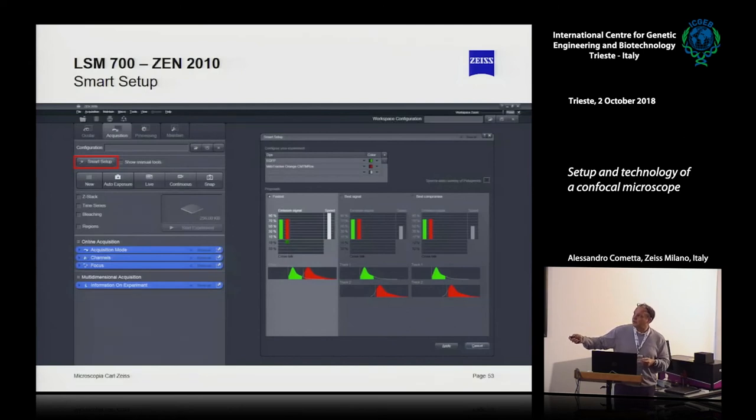In the best signal, it acquires before one and then the other. What is the difference? The difference is here. If I acquire simultaneously, the tail of my first dye will enter in the second one. And so I have some information that is wrong. I make some mistakes. It may not be so big, but it can be an issue.